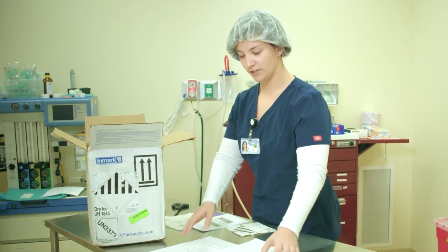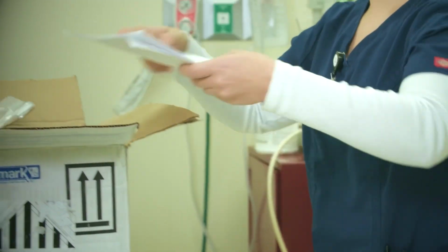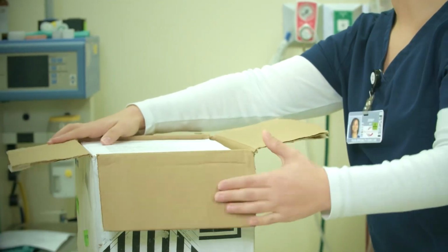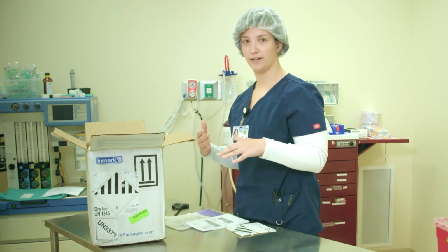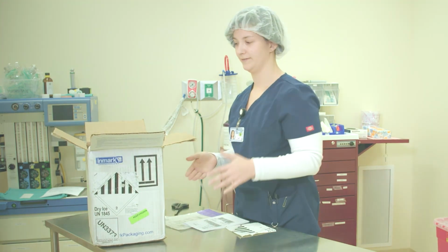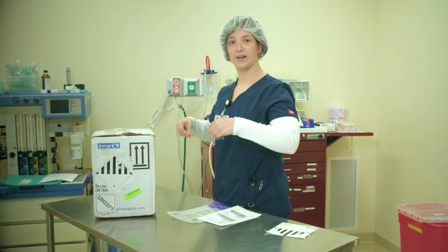Once you have all those stickers on there, you can grab all of your requisitions for each patient and place it on top of the styrofoam box. This way the paper does not get wet from being exposed to the dry ice. With your samples inside, seal your box up with tape.